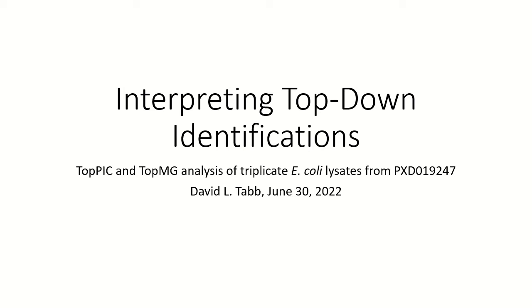TopPIC and TopMG have already been run. Now, I'm going to include a link to the prior lecture where we demonstrated the configuration of TopPIC for doing this search. But we are adding another search engine in this presentation so that we have two different tool sets from the same suite. So TopPIC is designed for identifying proteoforms at large, and TopMG is particularly good at recognizing post-translationally modified versions of those sequences.